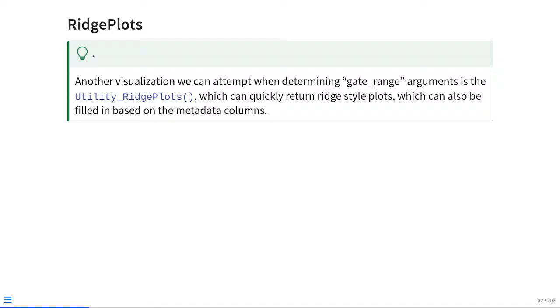Additionally, there's a different way of visualizing the same data in the form of ridge plots. Now, this is a one-dimensional style histogram. The benefit is that oftentimes you can fill in the histogram portion showing different conditions, like is this coming from a control, a PPD, or an SEB specimen? Is this from a male or female infant? From what time point was it coming? So it's quite useful in the context of normalization steps as we start trying to fix things in a few weeks.